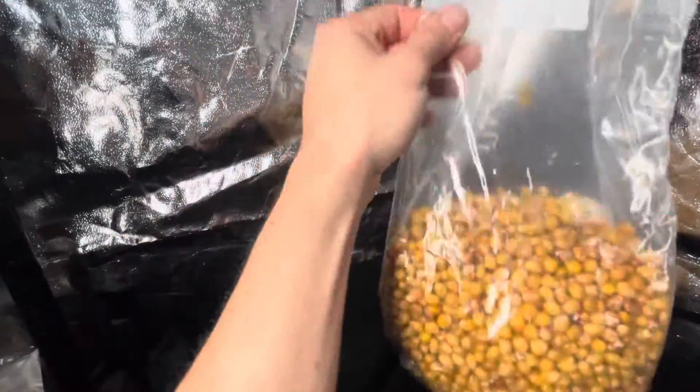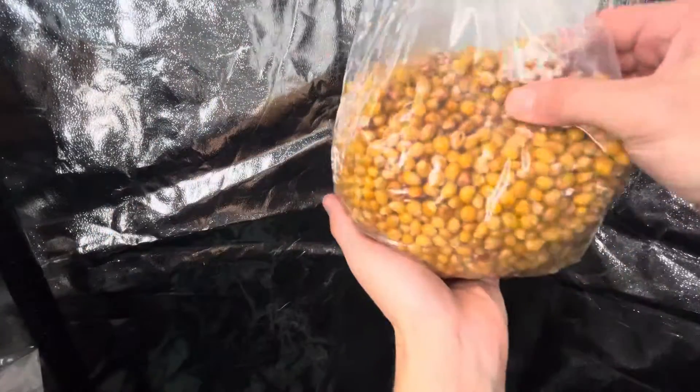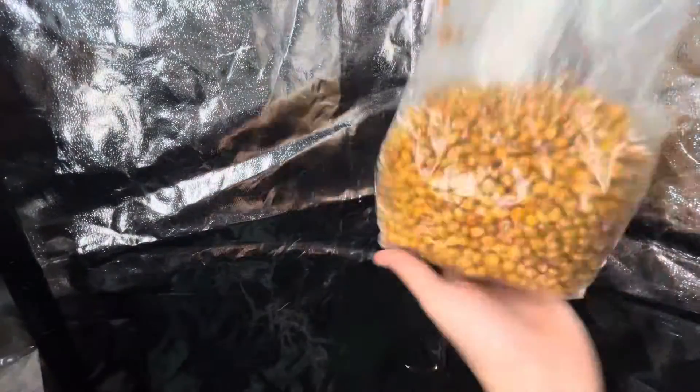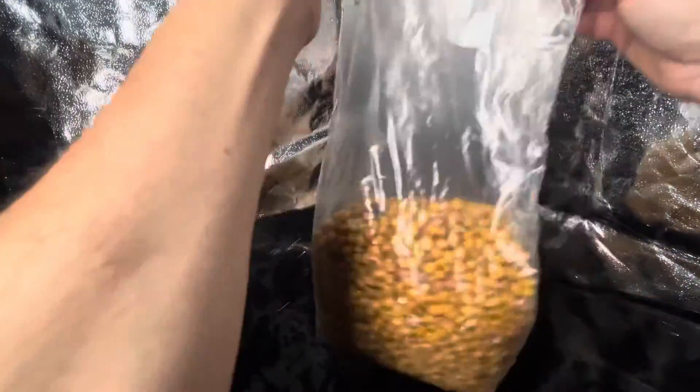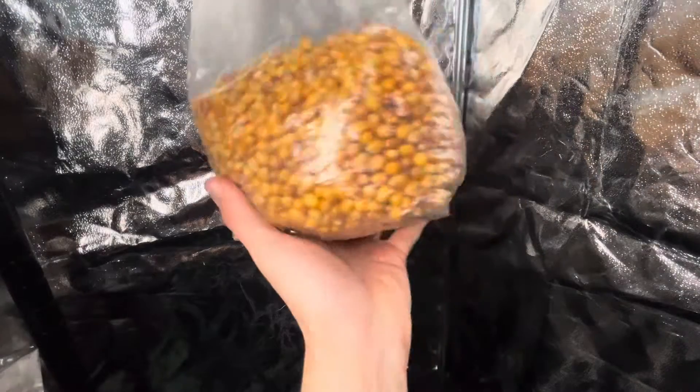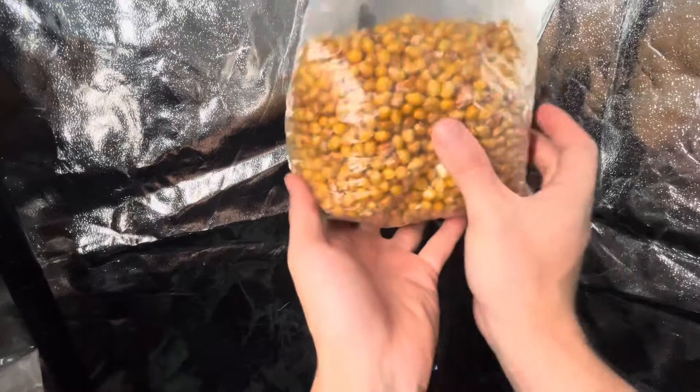I like to be pretty thorough when I break and shake — you really want to get that even distribution and it can be a little bit difficult. Try and knock some of that back down to the bottom. There you go, this has been broken and shaken.